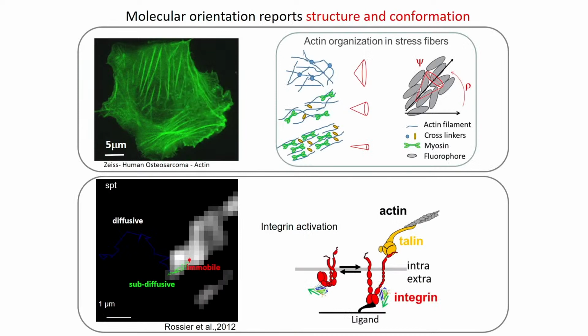So actin organization is actually made of orientations of actin filaments. And this is this top figure that I'm showing here, where we can see that depending on the region of the cell you're looking at, these actin filaments can take very different type of orientation organization, from very highly wide aperture angular networks, such as found, for instance, in the lamellipodia of cells, to very highly parallel organizations, which can be found, for instance, in stress fibers.